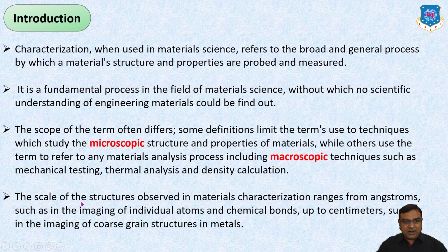The scale of the structures observed in materials characterization ranges from angstroms, such as in the imaging of individual atoms and chemical bonds, up to centimeters, such as in the imaging of coarse grain structure in metals.